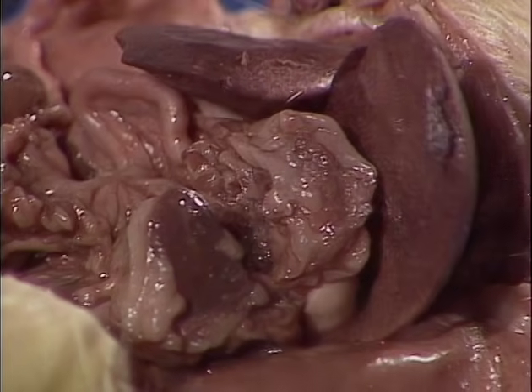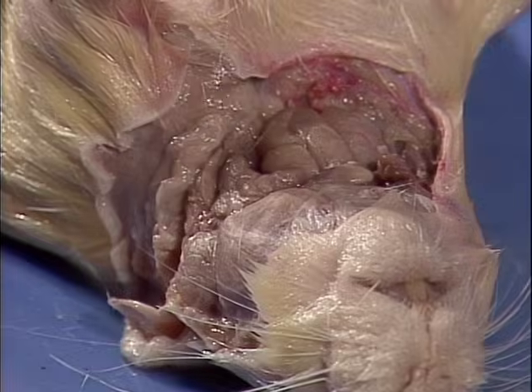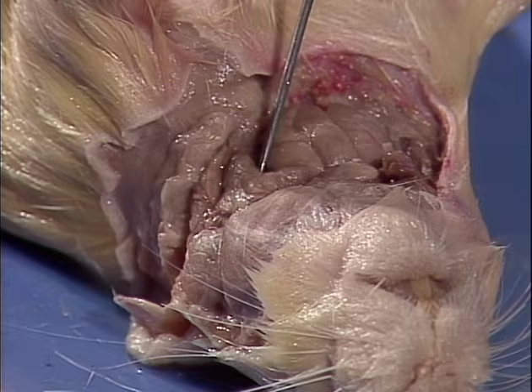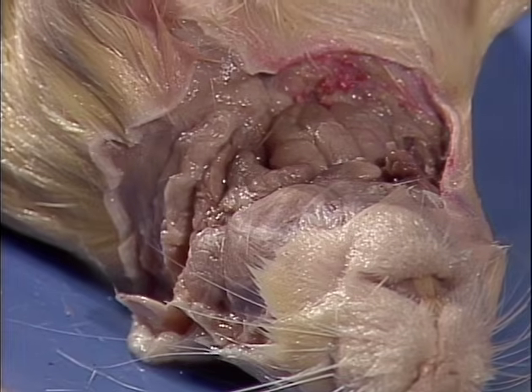I have removed the skin from the side of the head right below the ear to locate some of the other glands involved. This gland below the ear is called the parotid gland. It produces saliva. The saliva will travel through a duct up to the mouth cavity, where it will moisten the food to begin the digestive process.